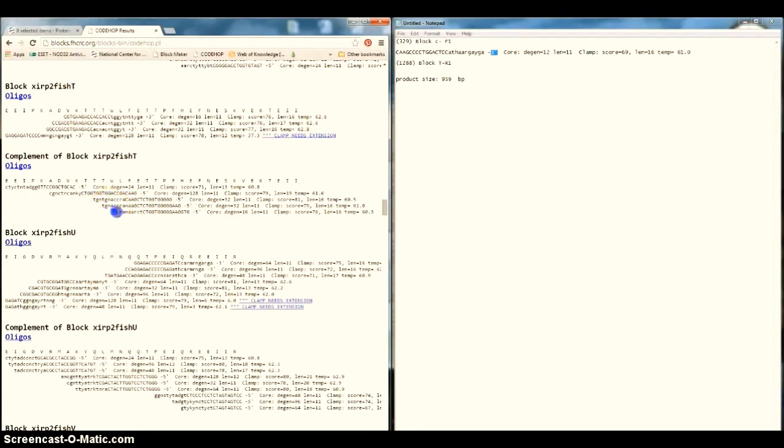And usually this kind of beginning could be a problem, but it's better than the others. It's not a problem because the score is 79 and 76, sorry, and it's quite low when you compare with the others, but it's okay.